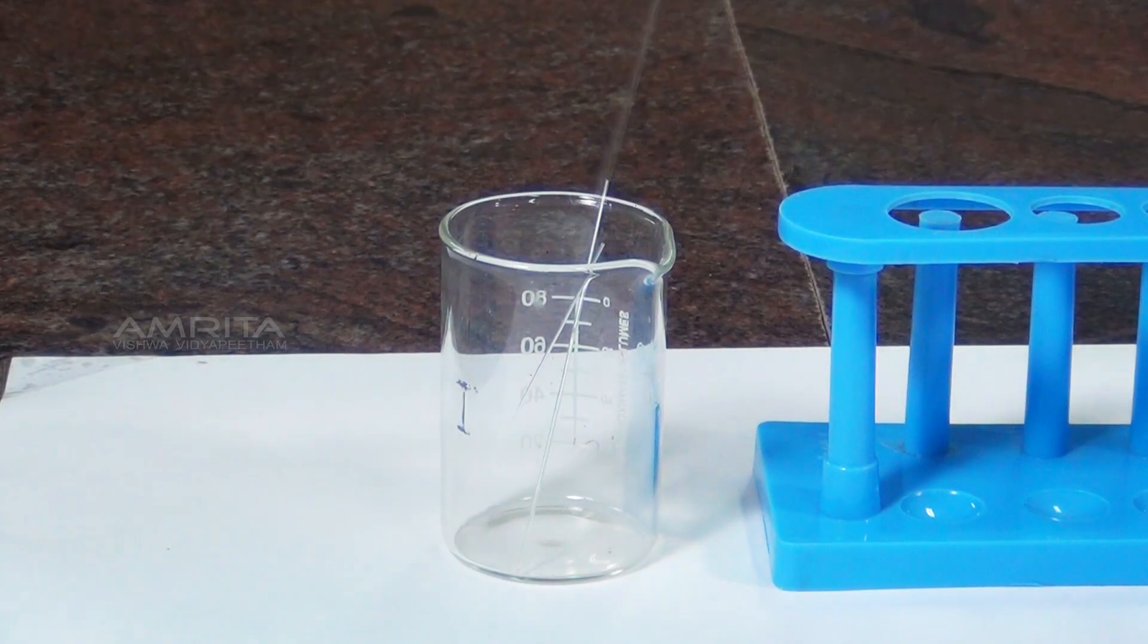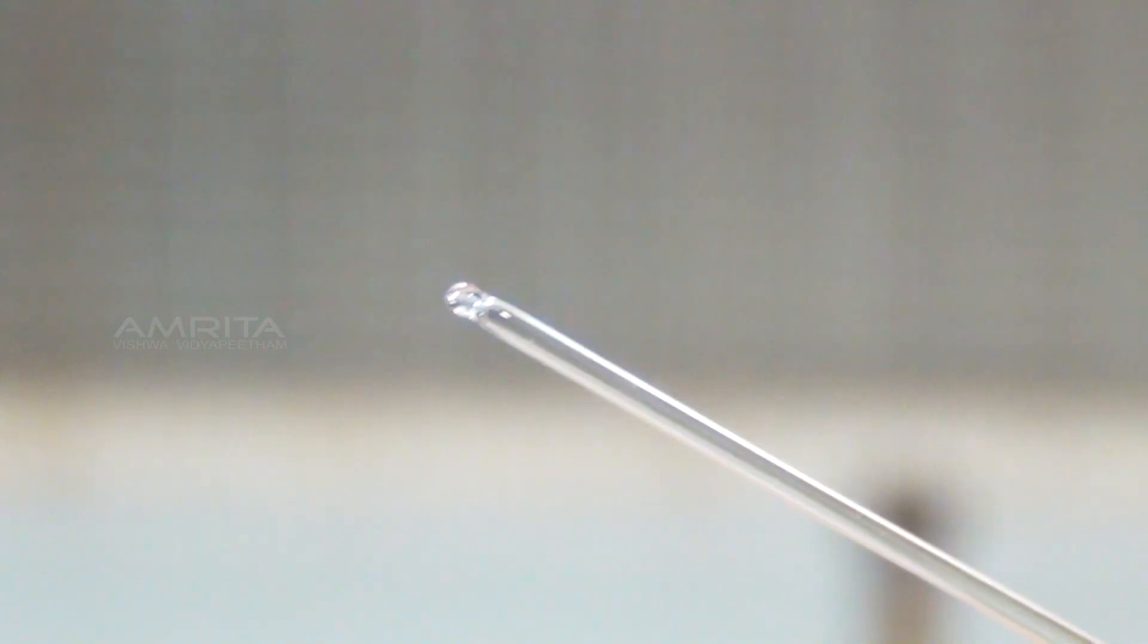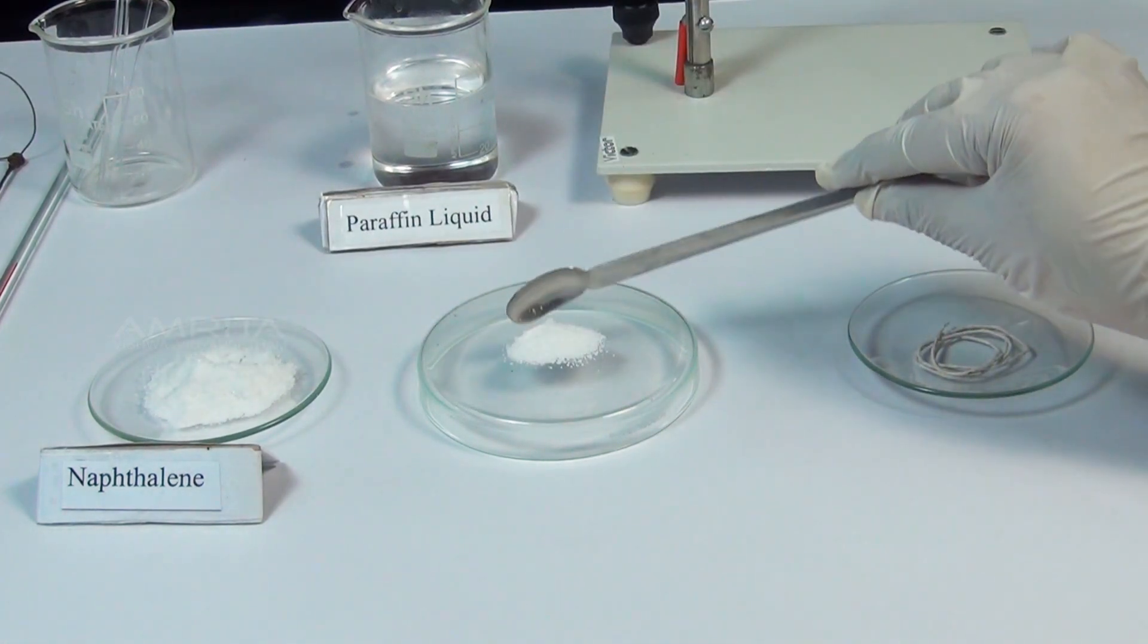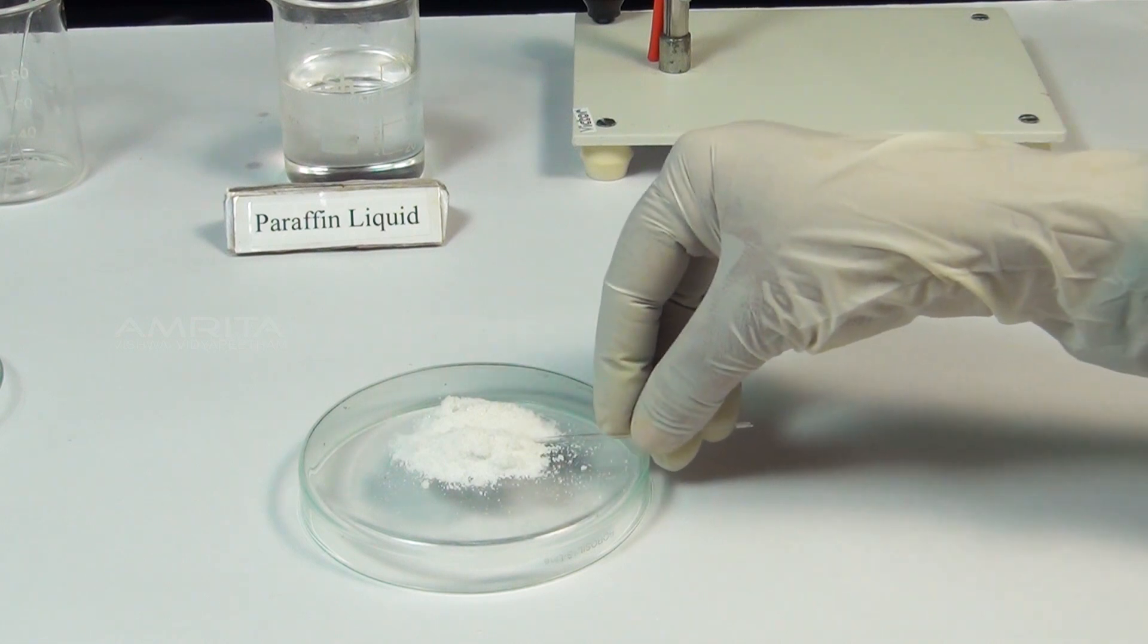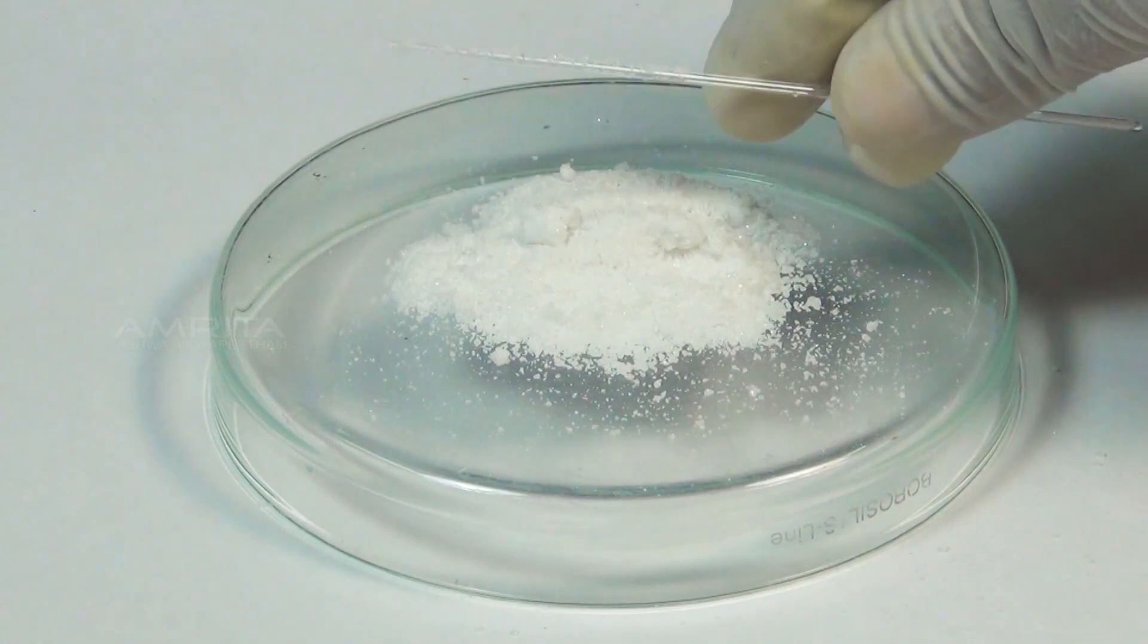Procedure: Take a capillary tube and seal one end by heating it in the flame of the Bunsen burner. Now, using the spatula, make a heap of the powdered naphthalene on the glass plate. Push the open end of the capillary tube into the heap. Some substance will enter into the capillary tube.